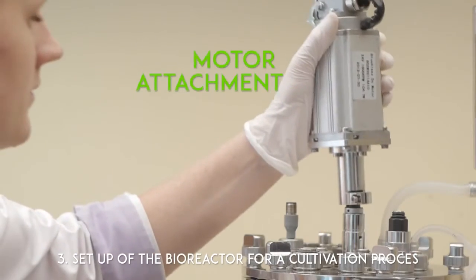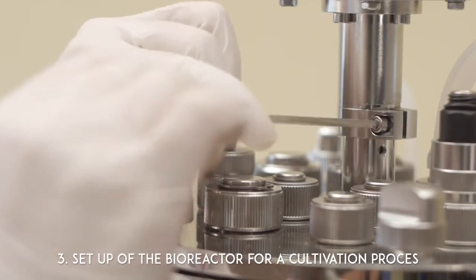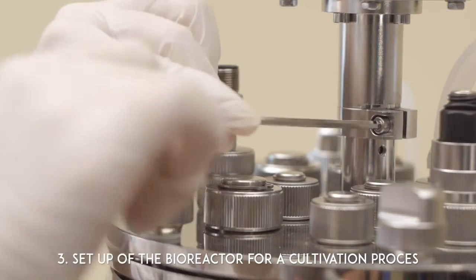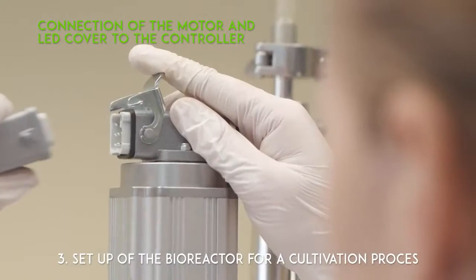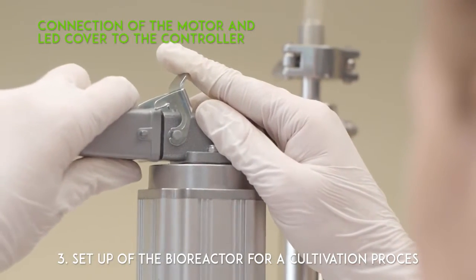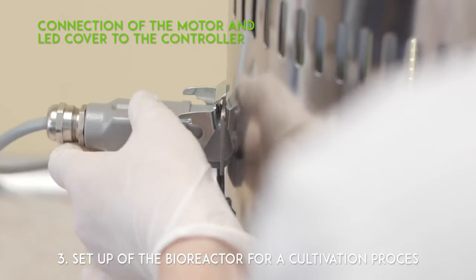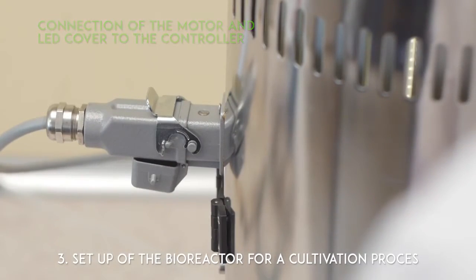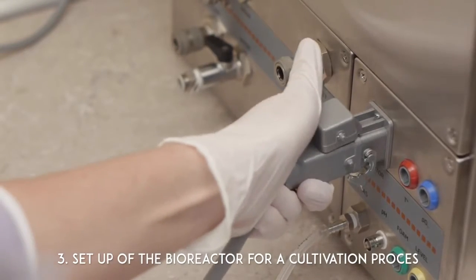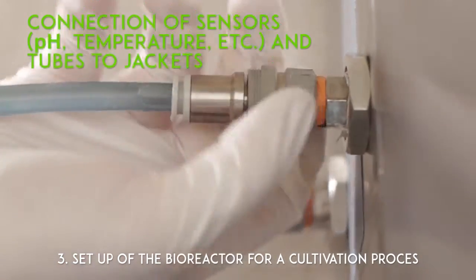Motor attachment. Connection of the motor and LED cover to the controller. Connection of sensors and tubes to jackets.